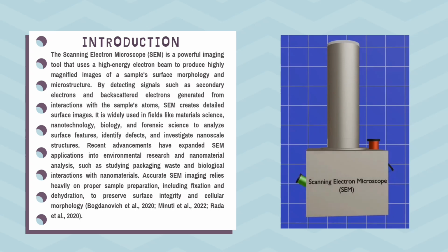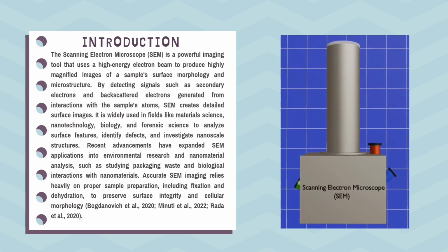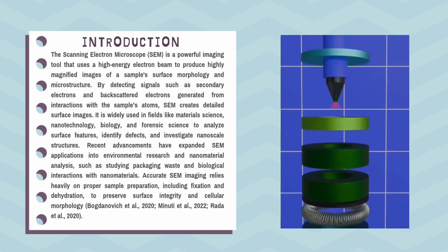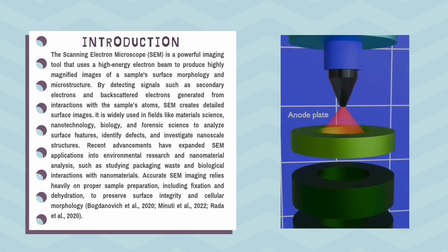Introduction. The Scanning Electron Microscope (SEM) is a high-power imaging tool that uses a focused beam of electrons to project a detailed image of sample surface and microstructure. It detects signals like secondary and backscattered electrons to create high-resolution images.